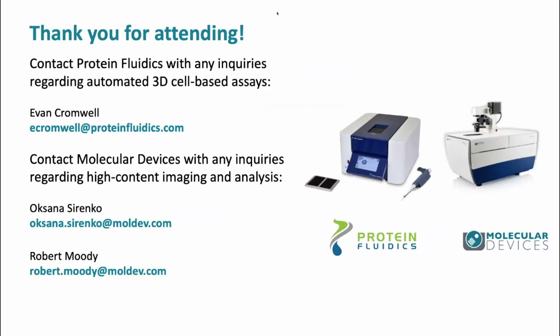So it's very interesting. No, that's great. If I'm hearing that right, you can have multiple spheroids per well so that you have even more data points per channel. Yes, this is correct.